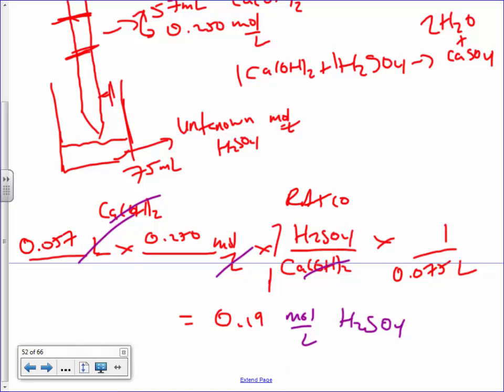So one more time here. You want to measure a solid? Use a scale. You want to measure a liquid? Use literally everything I have in those containers. They all measure liquids. But if you want to measure a concentration, concentration is very difficult to measure. The most accurate way of doing it is a titration, which sucks because there's a lot of steps to it.